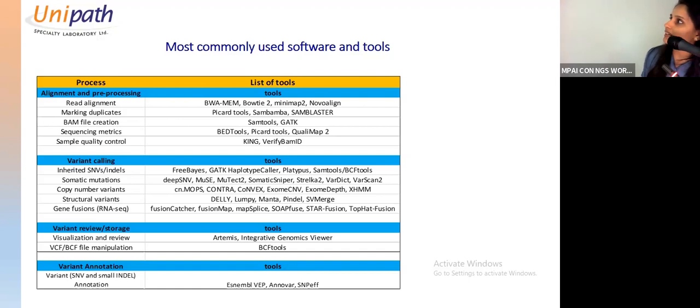Now this is the sequencing metrics. After you get the BAM file, the file is also big, because when you have millions of reads, it is a representation of millions of reads along with the reference genome. So how do you check the quality? For FASTQ sequences, you use the FastQC tool, right? Here are a number of tools which give you an overview in a beautiful graphical way of the insights you consider while sequencing and how reads are mapped. All the metrics you get from here, using this type of tools.